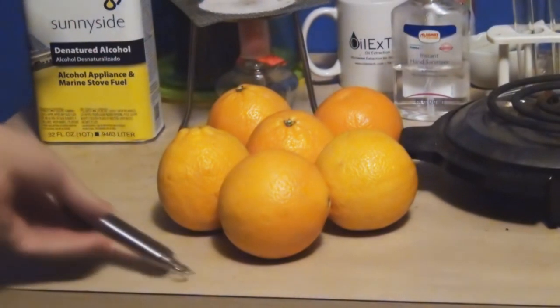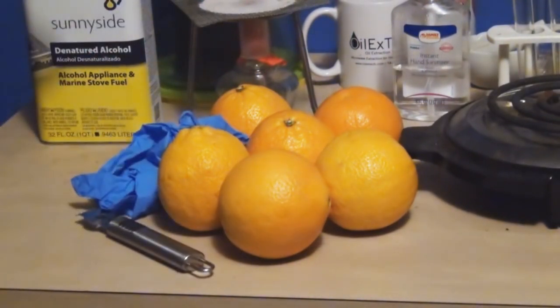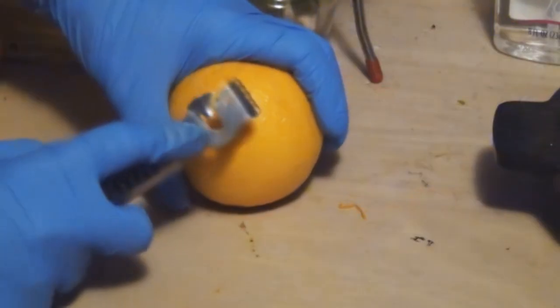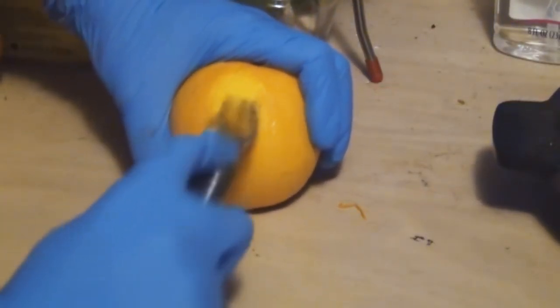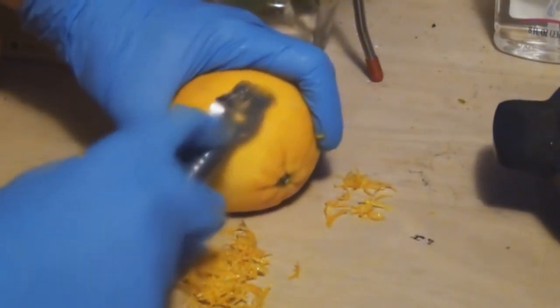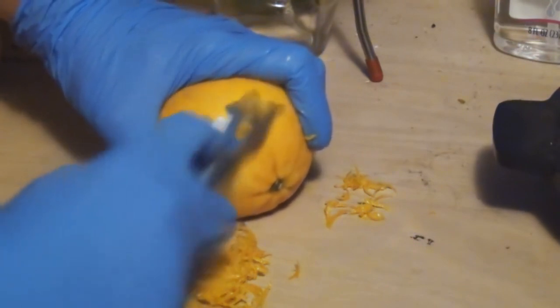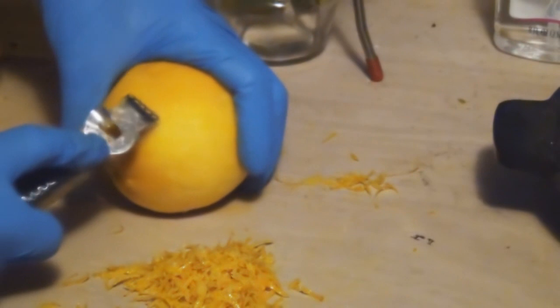To get started, go ahead and grab a pair of gloves and a citrus zester of some kind. We have about 6 oranges to work with, but you can definitely do this experiment with just 3 or 4. Next, go ahead and remove the peel from your oranges. Remember just to remove the outer peel, which is the orange part, and not the inner pith, which is the white part.